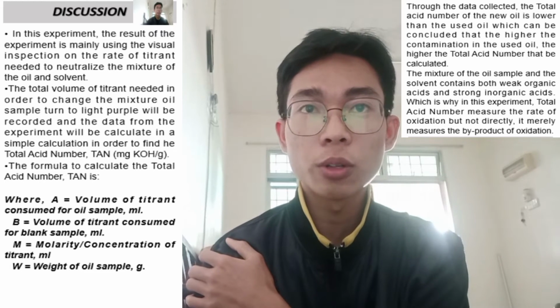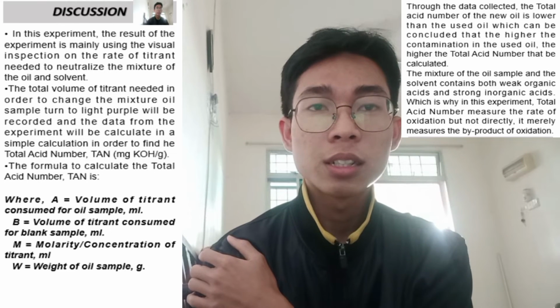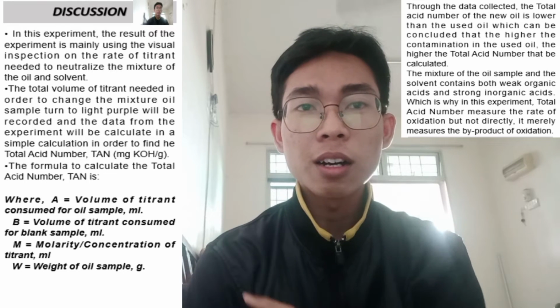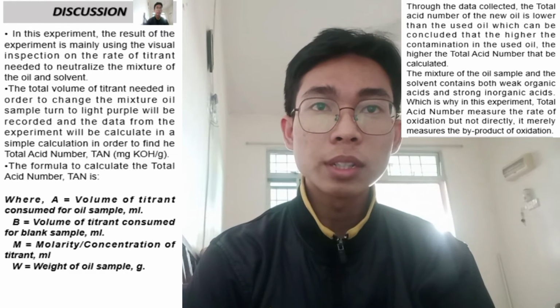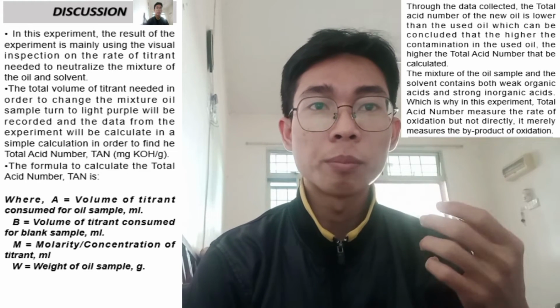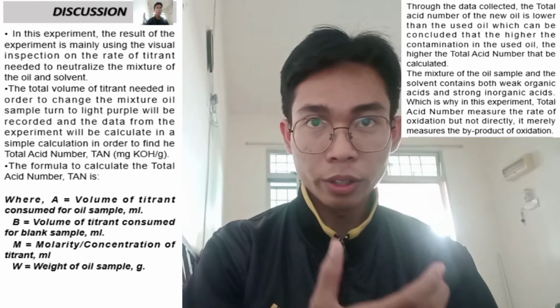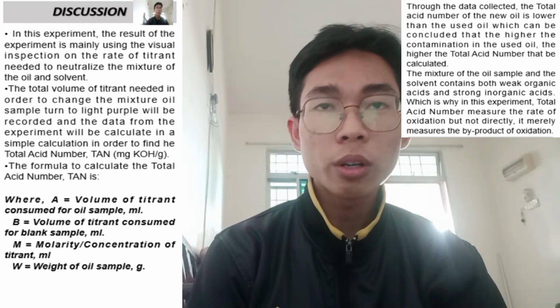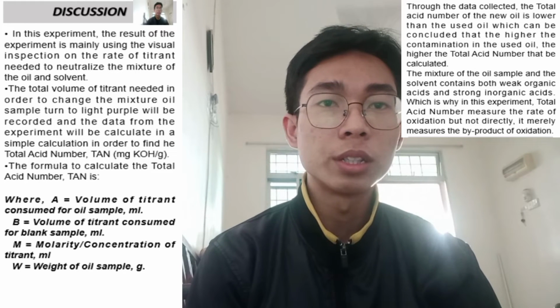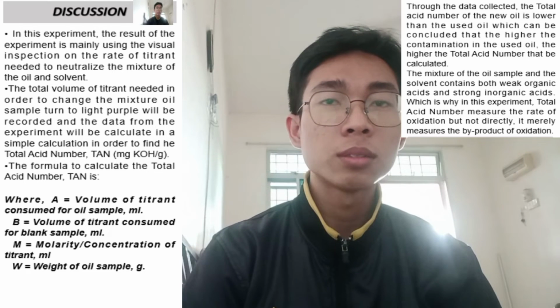the total acid number for the new oil is lower compared to the used oil. It's because there is a lot of contamination in the used oil, which has burning byproducts, metal and other acids in it. So for the new oil, the total acid number will be very low compared to the used oil, but not as low as the blank sample.